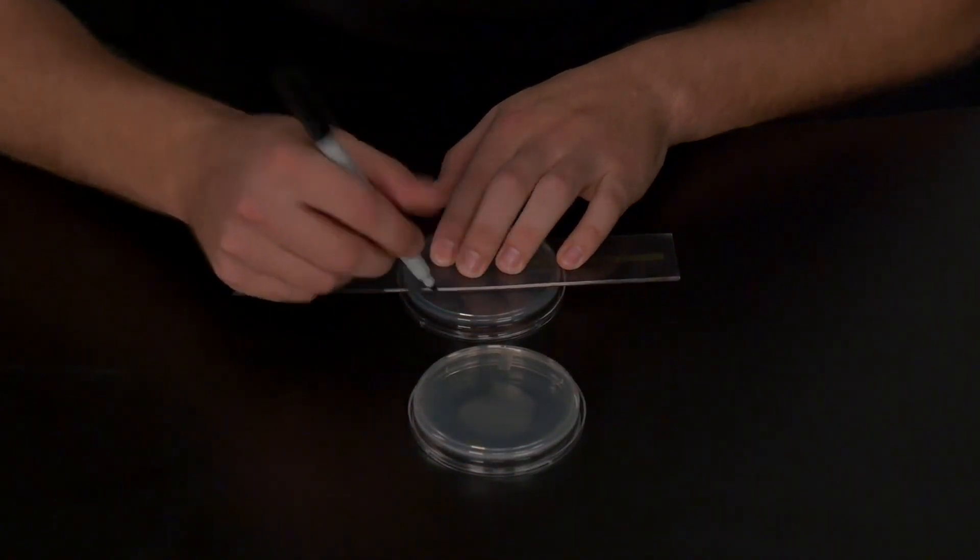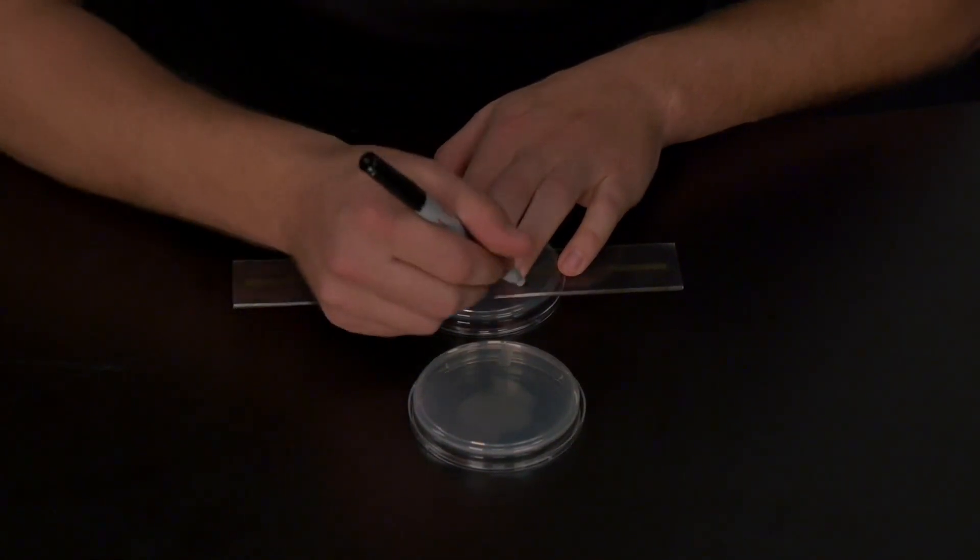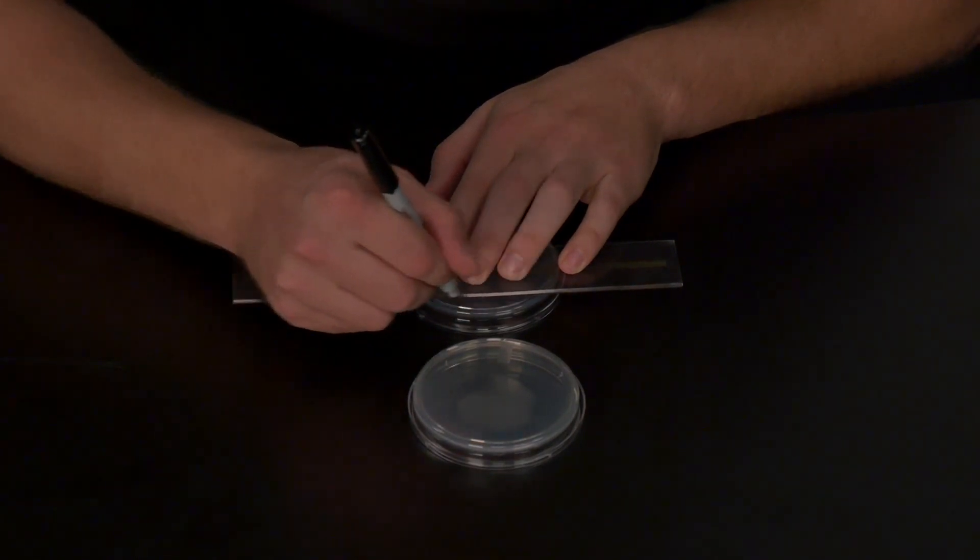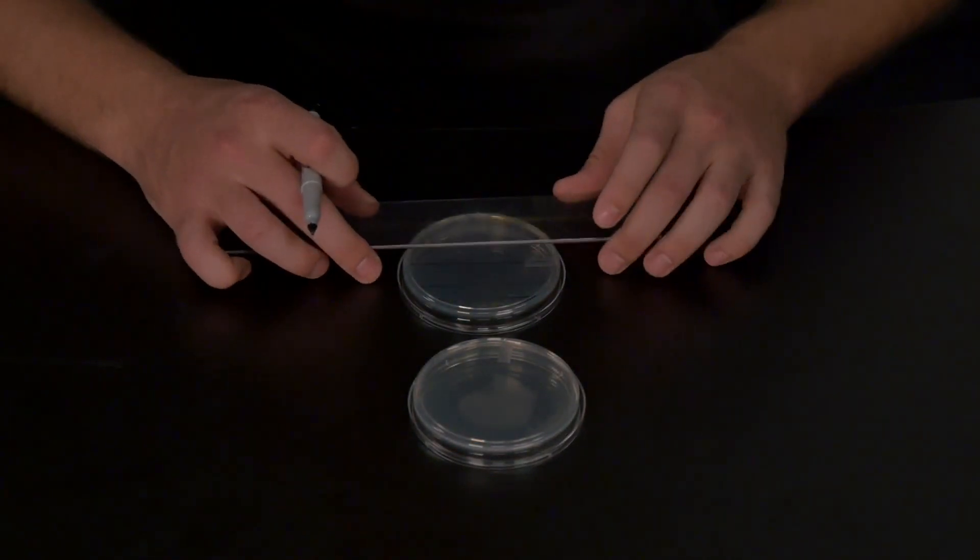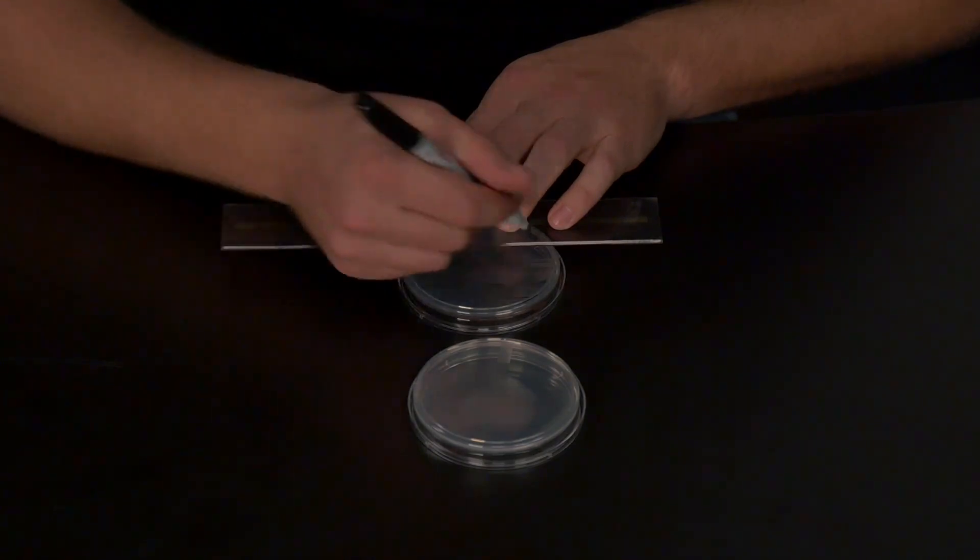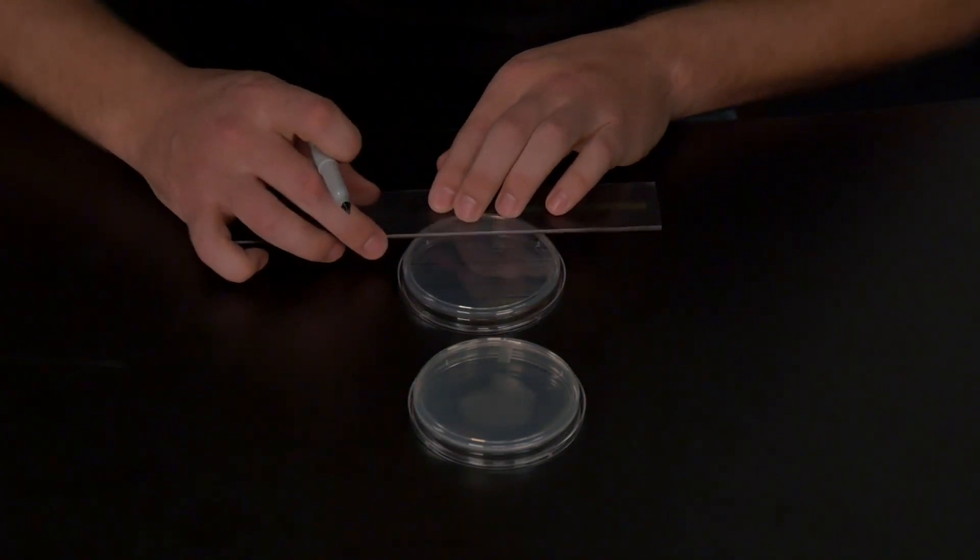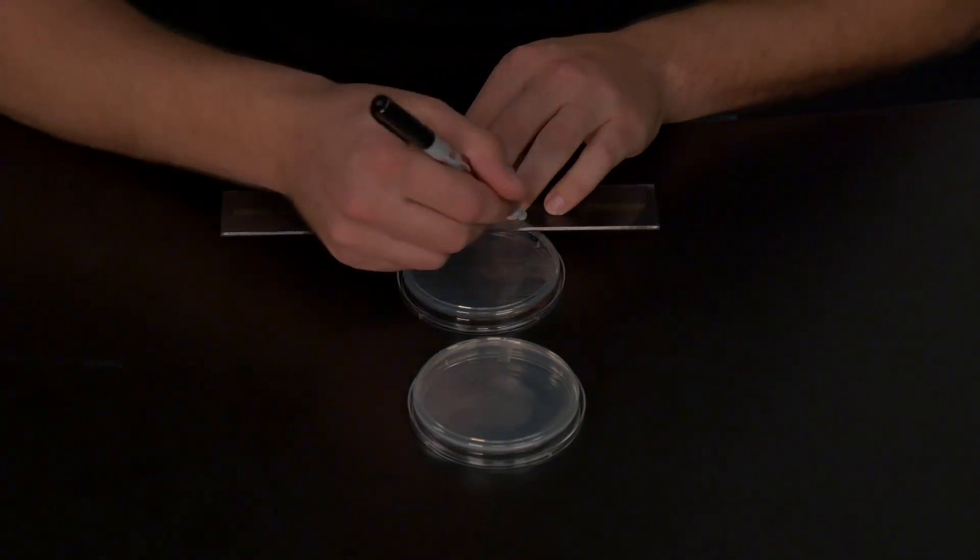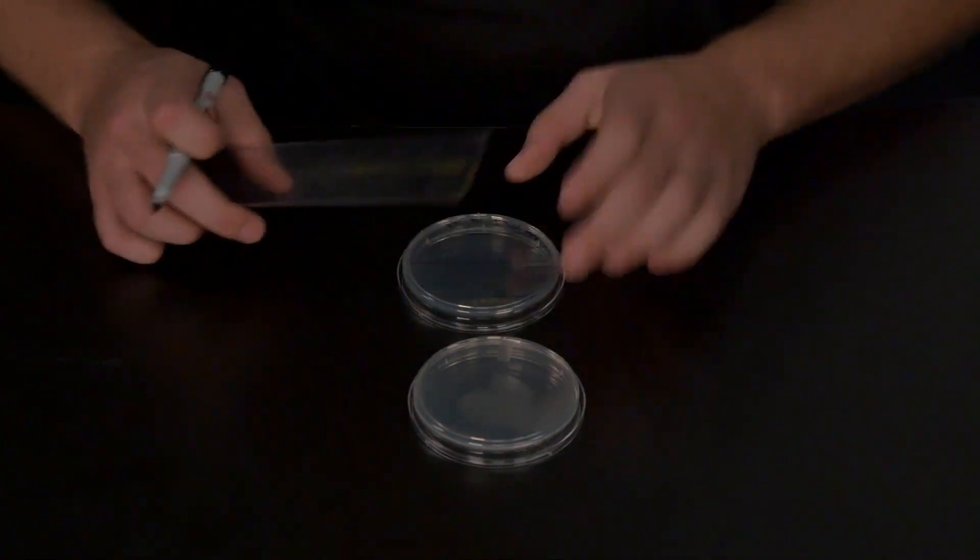Next, a grid system will be drawn on the bottom of the new plate. We ask that you draw a grid with 5 vertical lines and 5 horizontal lines and space them equally apart. This will allow you to transfer 32 colonies onto this plate.